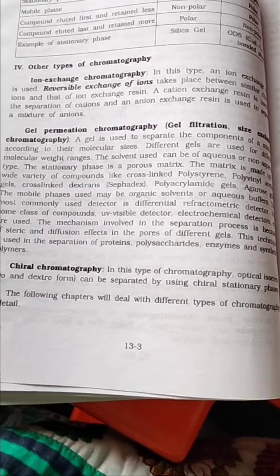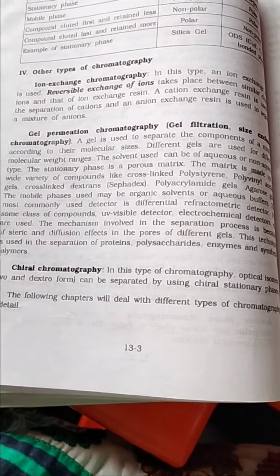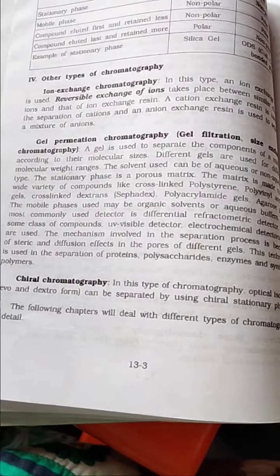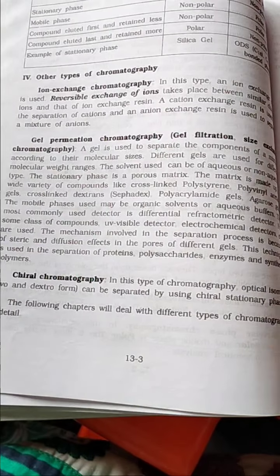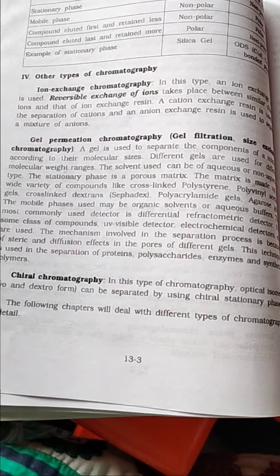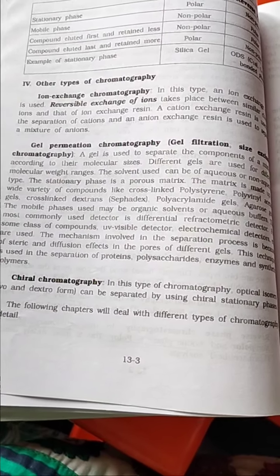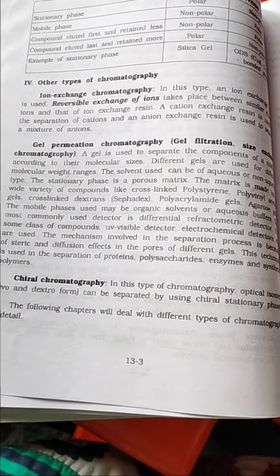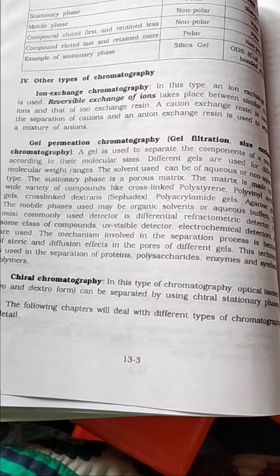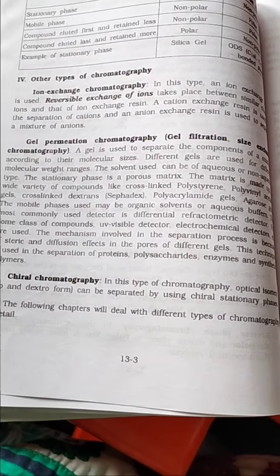The matrix is made up of cross-linked polystyrene; we already know polystyrene, and polysaccharide gels are also used. The most commonly used detector in gel permeation chromatography is the refractometer detector.